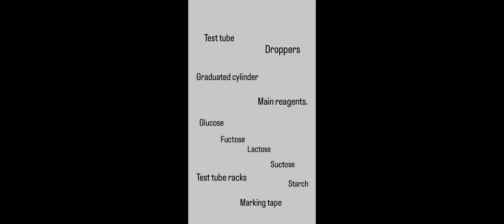Good day everyone, my name is Peter Aganas and I'm going to discuss the carbohydrate experiment. And here are the materials that we need in this experiment. General tests in carbohydrates. Make sure that you label the following test tube solutions to be sampled in carbohydrates.